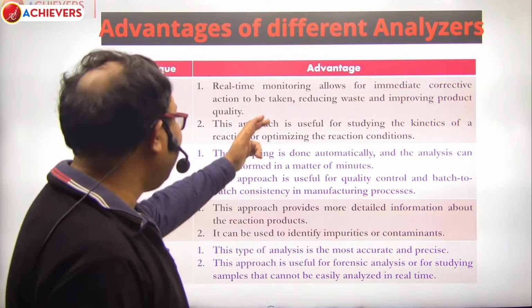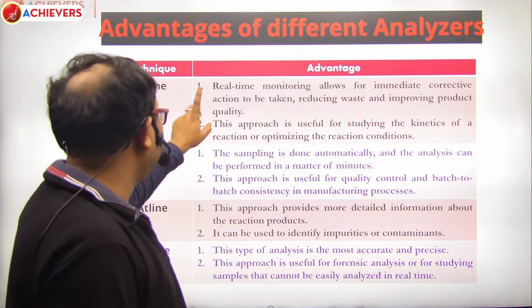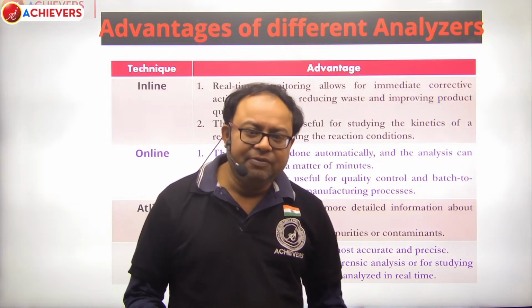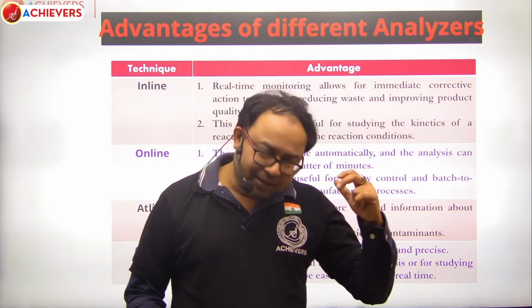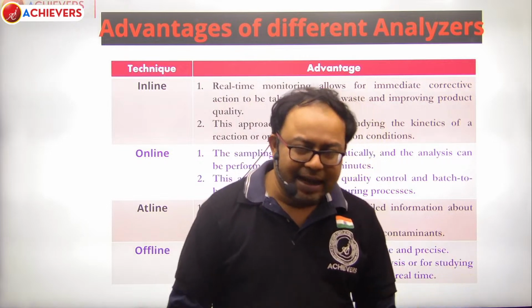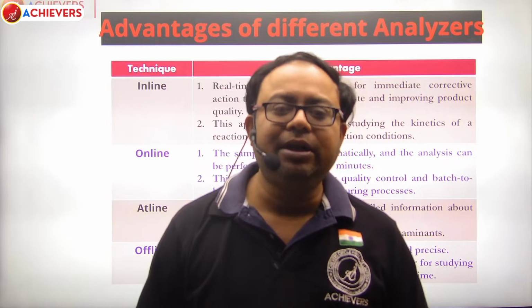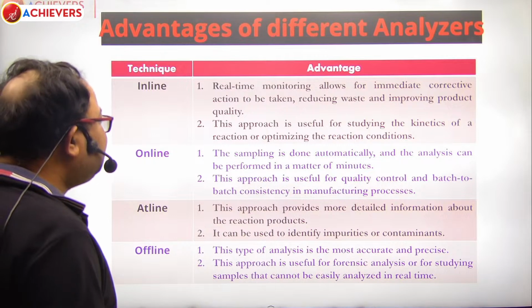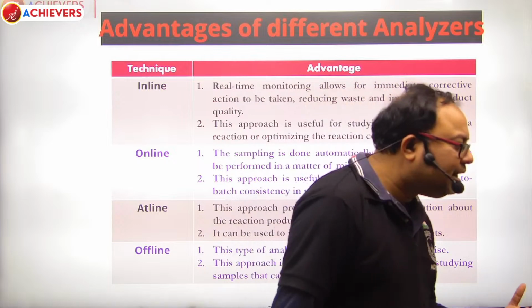The real-time monitoring allows for immediate corrective action to be taken, reducing waste and improving product quality. You have the provision of real-time monitoring, and through that you can take immediate corrective measures, and that eventually reduces the wastage. The next, this approach is useful for studying the kinetics of a reaction or optimizing the reaction condition. That's quite natural.